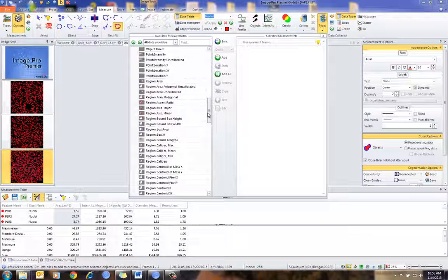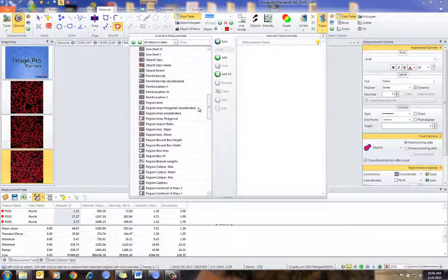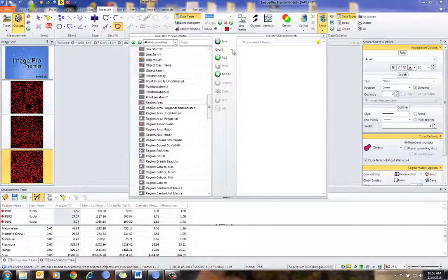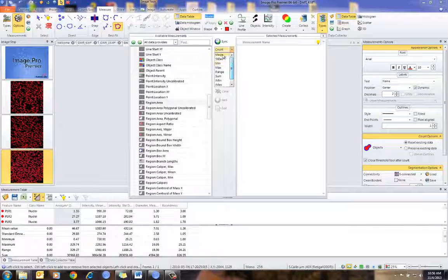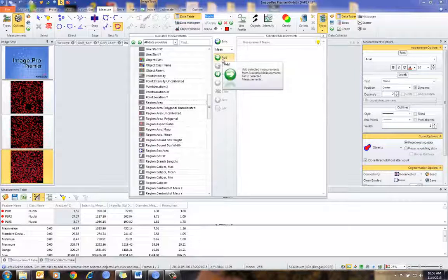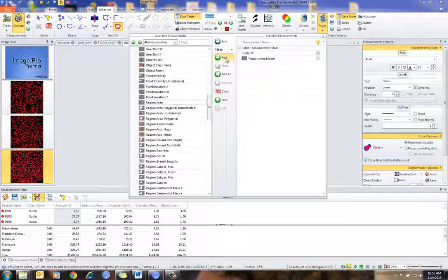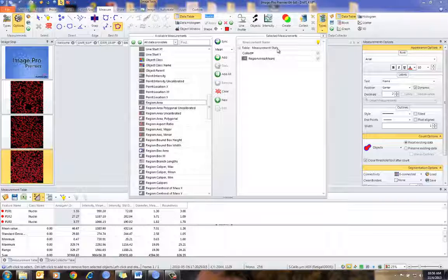In this case, if I want the area — maybe I want the mean area — I can easily select that. I can select mean, add that, and you'll notice it's been added to the measurement stats table. It's called region area mean.